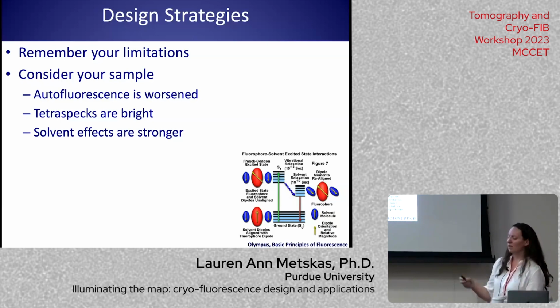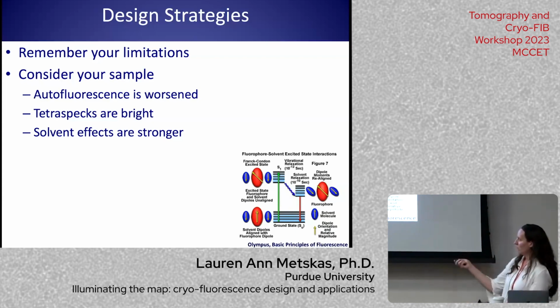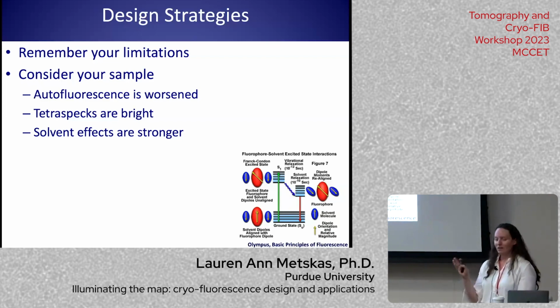When you excite a fluorophore, it basically becomes a different molecule. The molecular dipole gets much larger and it can actually change position a little bit. Then the solvent over time, while the fluorophore is excited, rearranges to, again, kind of cushion that. It makes the fluorophore a little bit more stable, and you pay for that because a little bit of energy is transferred. That's why you get the Stokes shift, the shift towards the redder colors between excitation and emission, and then you fall back down. So in cryo, of course, our solvent can't move, and so you're not going to get this effect. It plays some havoc with the spectra sometimes.